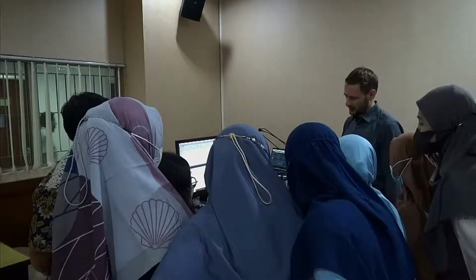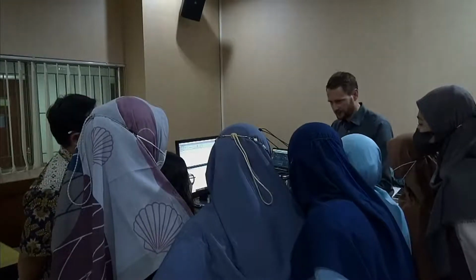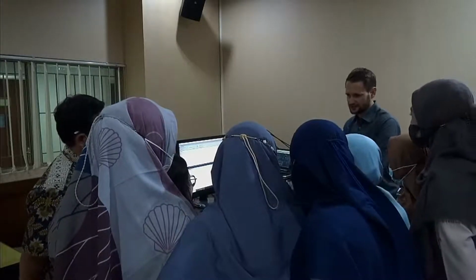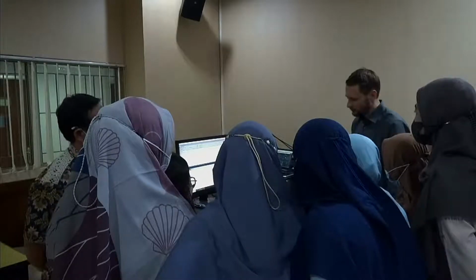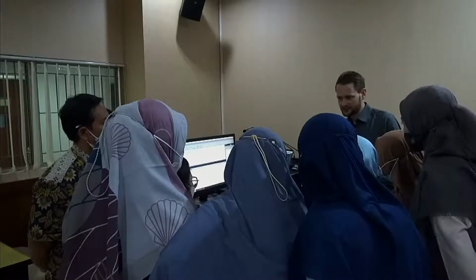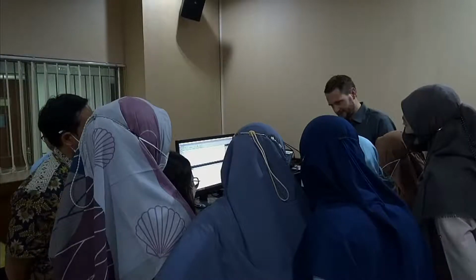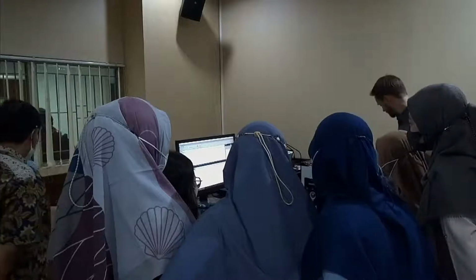Because what happens with the instrument, whenever it comes from manufacturing, it goes first through the calibration. For the calibration, we use the NIST traceable standards. So we calibrate at different particle sizes to be everywhere perfectly within the range. But we also use this internal standard, which is not a real one, just one we bought a huge batch of and we always use. The reason we do that is we use it also during the final testing. So you have the results of the NIST traceable and this. But this we can give you, because it's not so expensive, we give you for free in the suitcase.